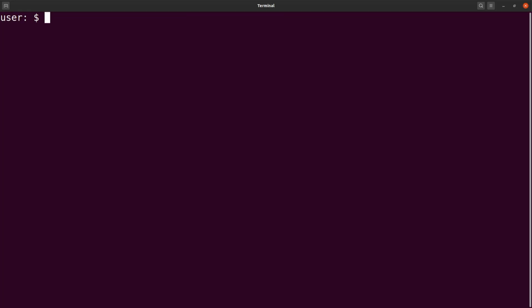So on the terminal, the first thing I will do is to create a working directory. So I will say mkdir VCFs. I will then cd to it. The reason why I do this is to separate files that I'll be generating for this exercise from other files on my PC. Okay, so doing this helps you to organize your files and prevent accidental removal and modification of files. So that is why I create directories for every project that I do.